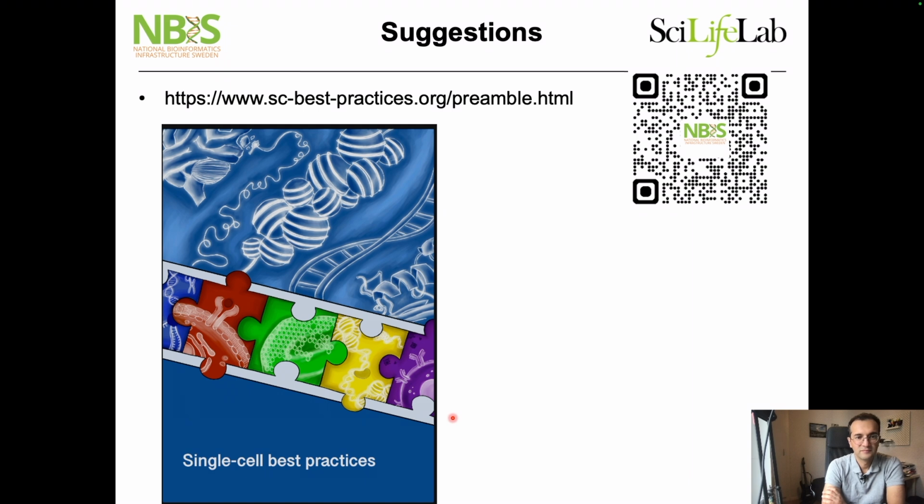Where do you think will the trend of data generation in single-cell RNA sequencing go to in the next few years? You already showed some, like bulk RNA sequencing, single-cell RNA sequencing, and then spatial RNA sequencing. Is bulk RNA sequencing still used, or are there still applications where you can see usage for this one, or is everything going to the newer technologies?